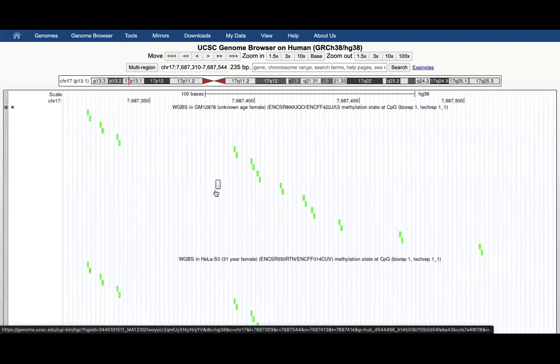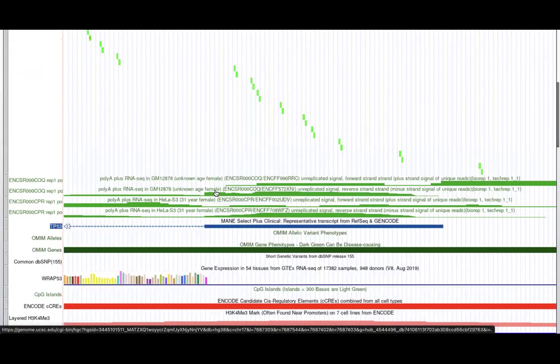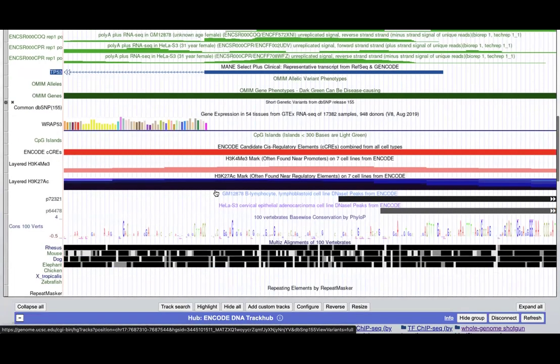This kind of fits with what we know about methylation repressing transcription, especially in promoter CpG islands. And TP53 is a major tumor suppressor gene, and the silencing of it through promoter methylation could contribute to uncontrolled growth and has been very relevant in cancer biology. So, observing these patterns visually helps us generate hypotheses about how epigenetic regulation contributes to cancer pathways.